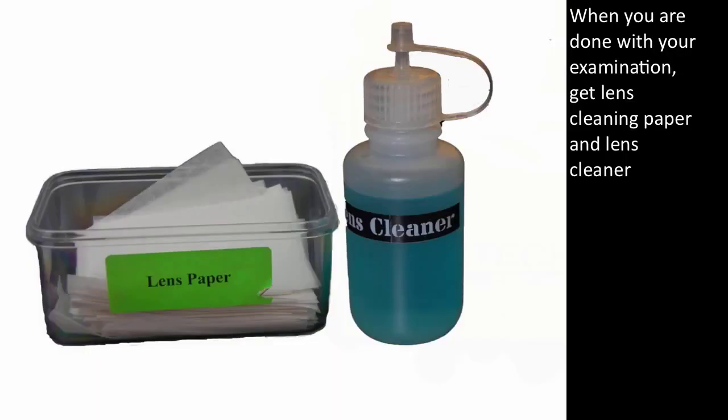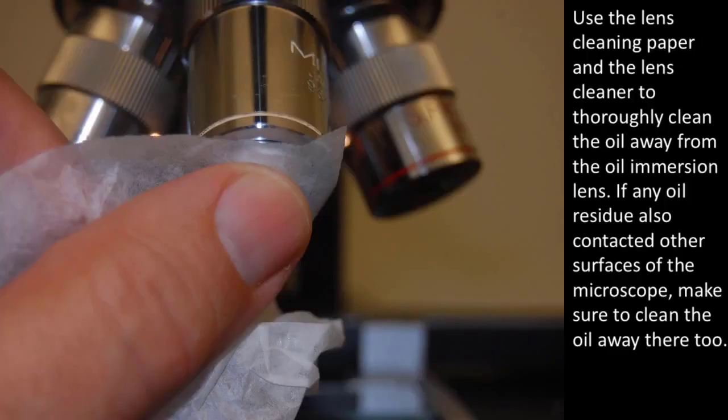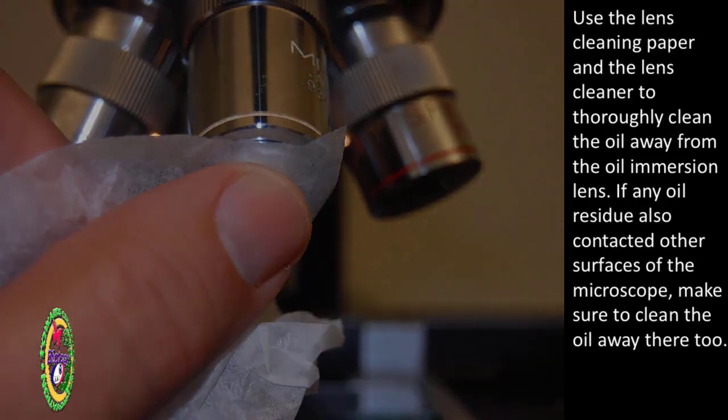When you are done with your examination, get lens cleaning paper and lens cleaner. Use the lens cleaning paper and the lens cleaner to thoroughly clean the oil away from the oil immersion lens. If any oil residue also contacted other surfaces of the microscope, make sure to clean the oil away there too.